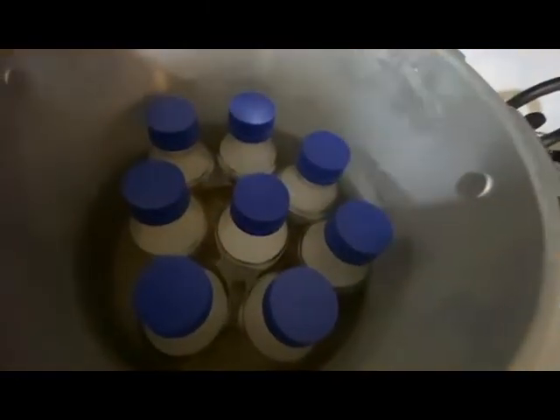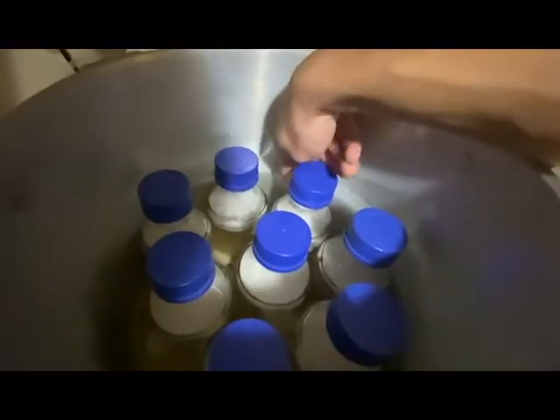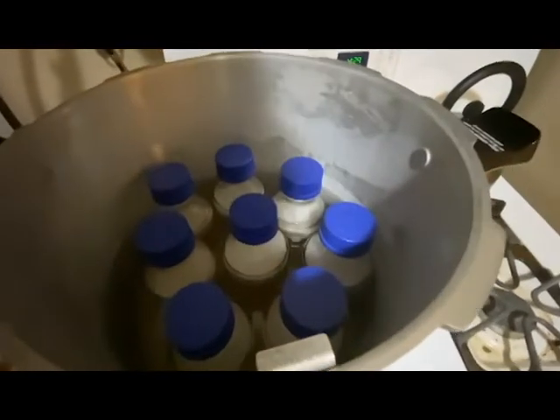I learned this from Bod's Agar Tech, I found on shroomery.org, which suggests to lower the risk of boiling over, bring the water level up to the liquid line within the media bottles. So that's my little tip slash trick for the day.